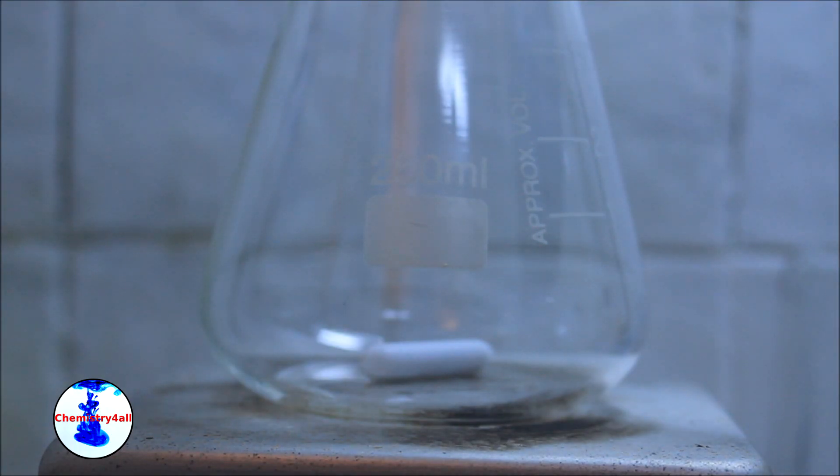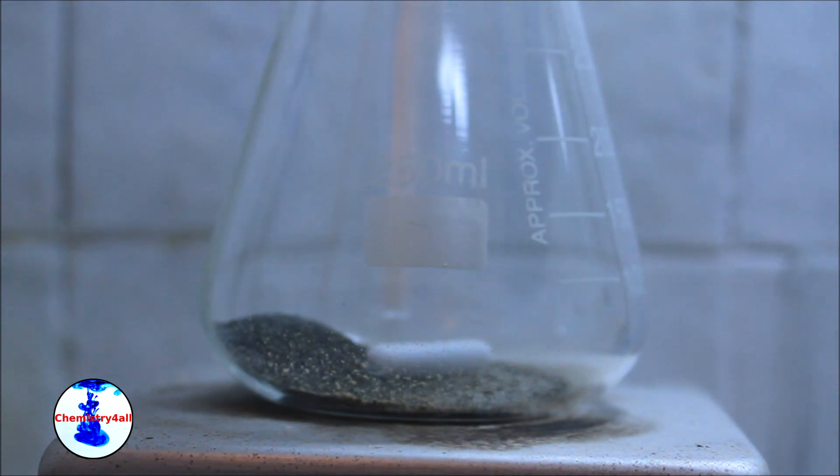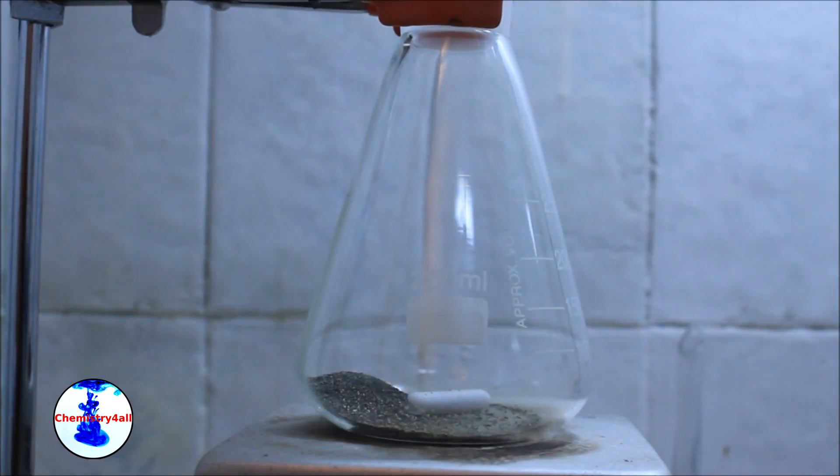First the potassium permanganate is added to an Erlenmeyer flask in addition to a magnetic stirring bar. Then, 130 milliliters of distilled water are poured into the flask.